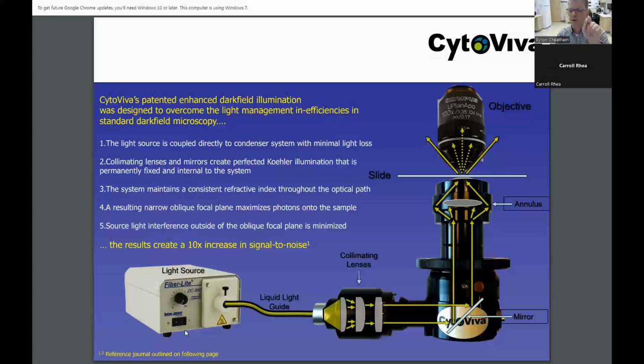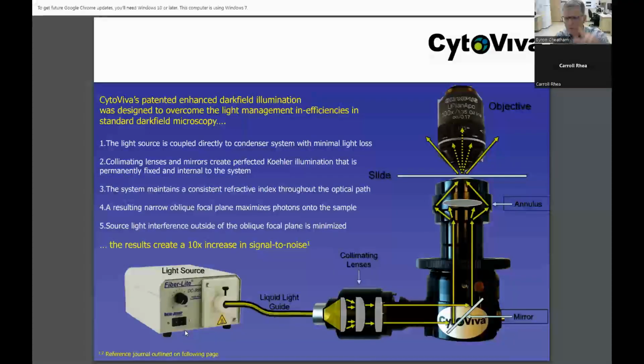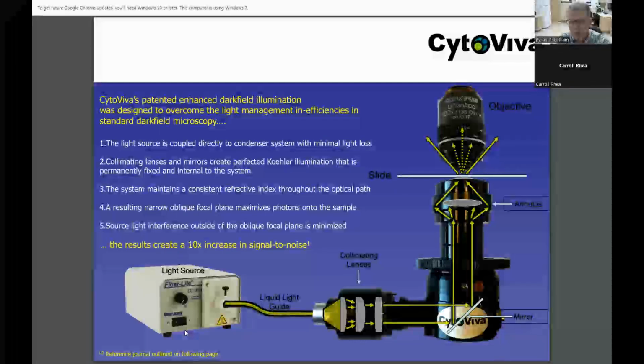But that excitation is very smooth, because if I'm going to capture a hyperspectral image, I don't want my source illumination to have lots of spikes in it. I want it to be very smooth, so that when that light interacts with the objects of interest in the sample, I'm able to see more of that pure reflectance spectrum. Now, we still need to do some normalizations to remove instrument response from the hyperspectral image oftentimes, but you don't want to try to remove the spiky spectrum that you would get with LED or mercury vapor and other types of light systems. If you do need to use those, though, you can use notch filters and other things to try to minimize that.